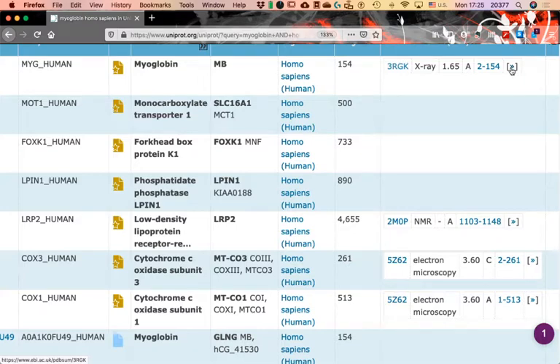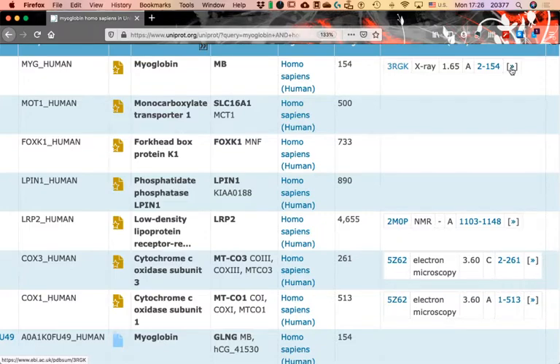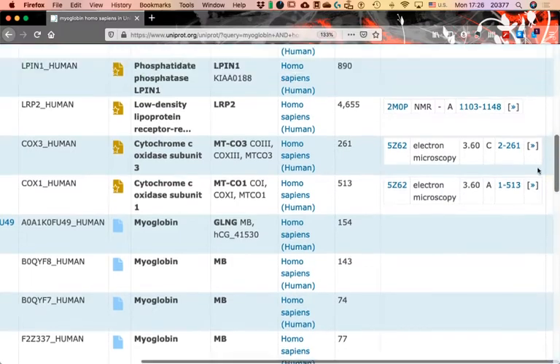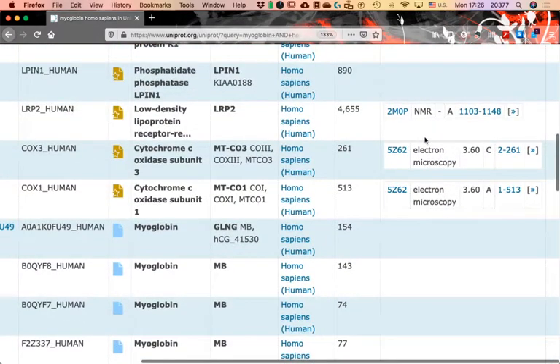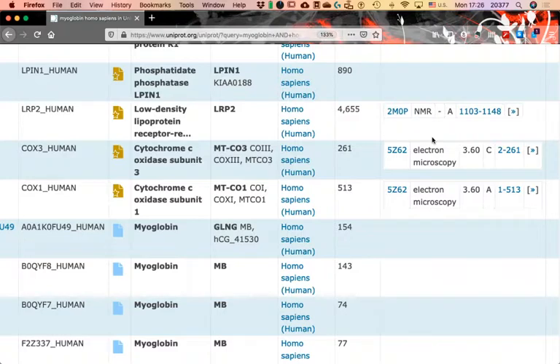A very nice feature is that not only do you get a check mark, but you also get the code, the resolution, and the coverage — that is, how many of the 154 residues are present in the structure. This is expected since in mammals and eukaryotes the first residue, usually a methionine, is removed from the protein. We can see examples of other things that happen in these databases.